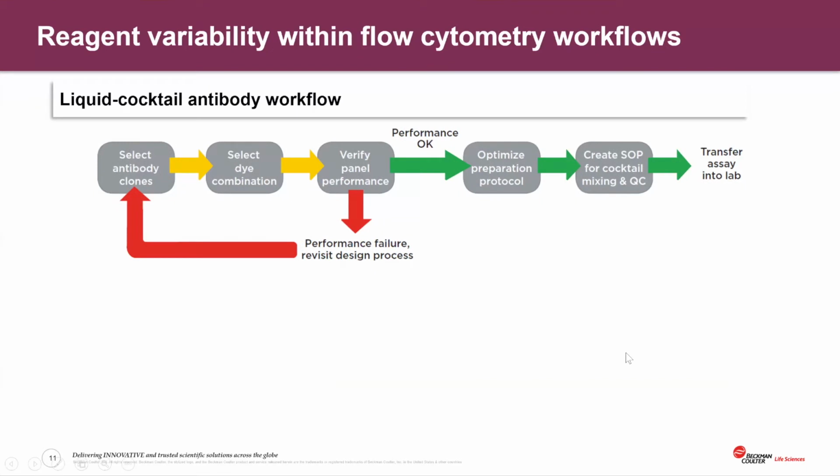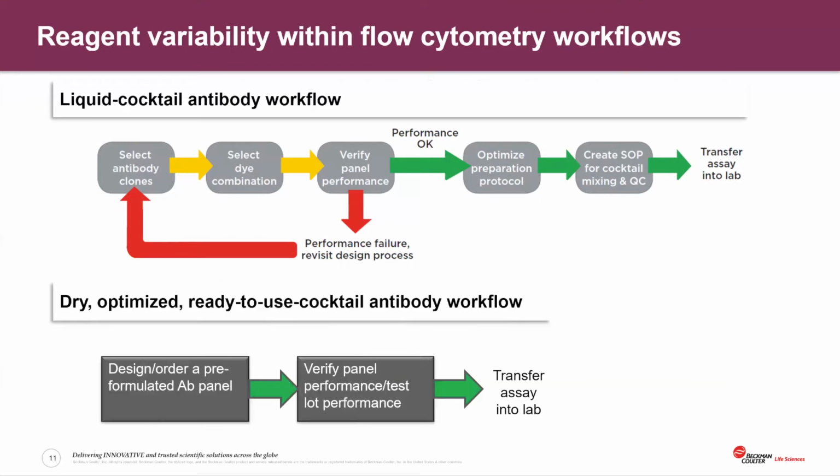So, is there an alternative method to the liquid cocktail antibody workflows? It just so happens that various vendors right now have these dry and optimized ready-to-use cocktails. These dry and optimized cocktails are pre-designed with specific antibodies of your choice that you pre-selected, or the ones that currently exist off the shelf.